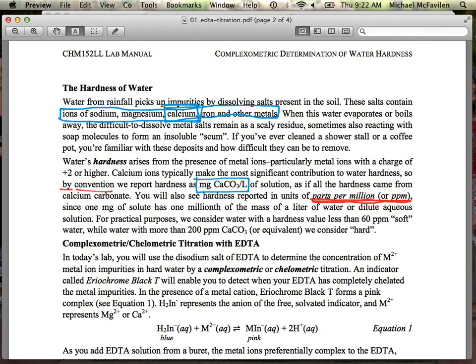We could weigh out all the calcium carbonate, but it's dissolved in water. How do we get the calcium carbonate away from the water? That's a little bit more difficult. So what we'll do is move to another situation. We'll pick something else that will react with one of those species. Which one are we concerned about, the calcium or the carbonate? The calcium ion. Okay? Calcium ion happens to be a +2 charge. Okay? And as you'll start to learn when you move into organic chemistry, what would be attracted to a +2 charge?